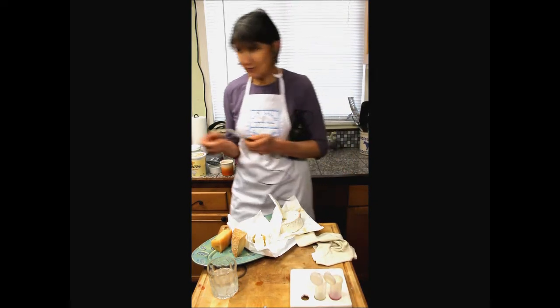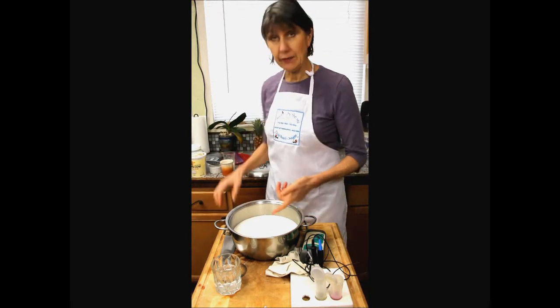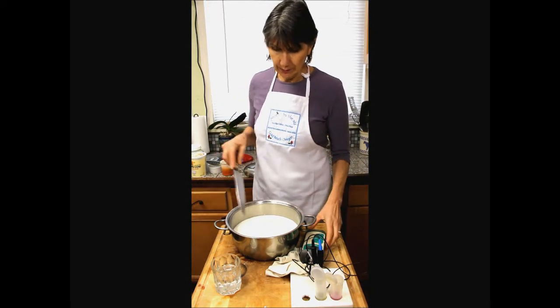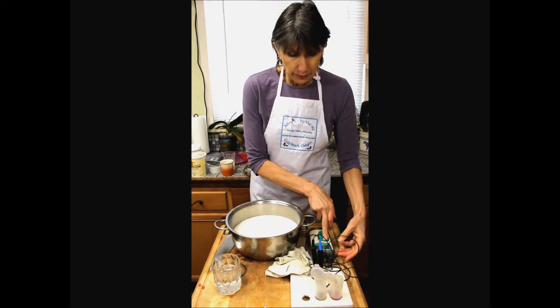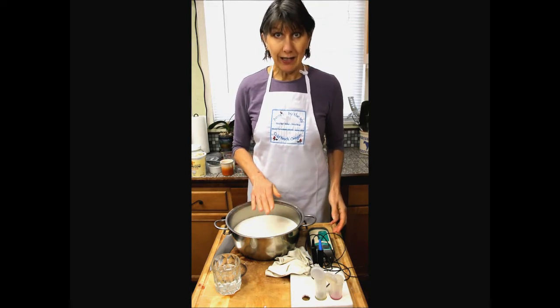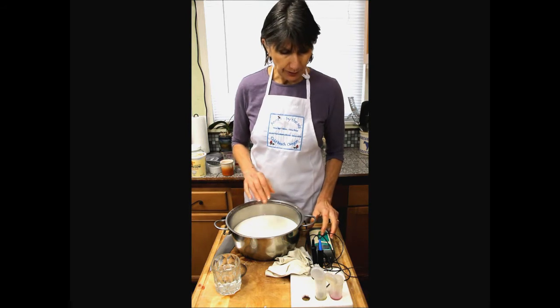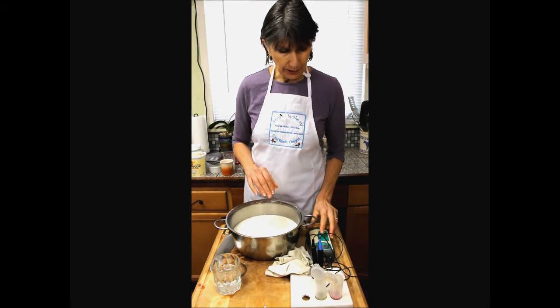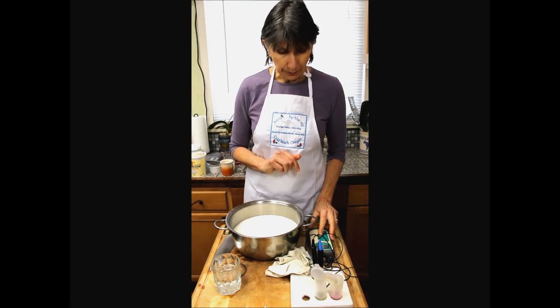Time for another wash. So our milk has coagulated into a nice firm curd that has a clean break. So now I'm going to cut the curd. Well, actually, we'll check the pH first. As soon as you cut the curd, the whey starts being expelled, and then you're checking really whey pH more than curd until you're able to firm the curd up again and check it separately. So our meter has drifted a little bit just sitting there. So I'm calibrating again.